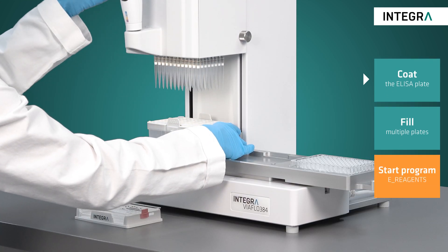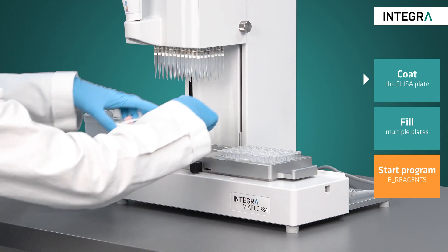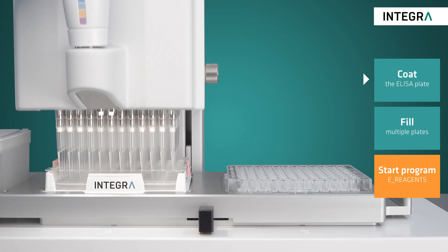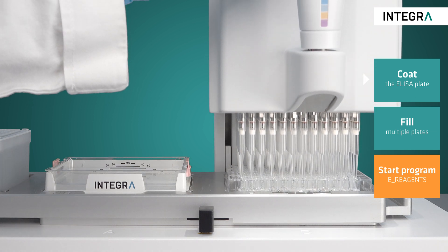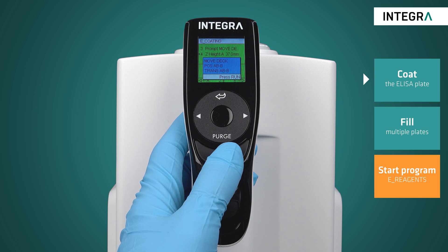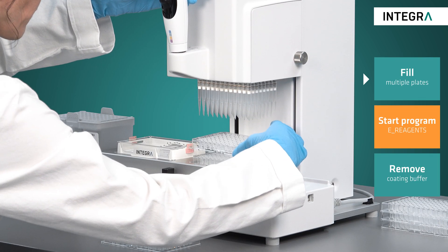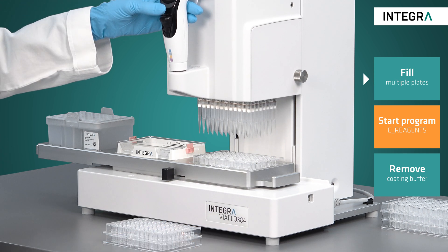After electronically loading grip tips, the coating buffer with pre-diluted capture antibody is dispensed into the ELISA plate — all 96 wells simultaneously. The custom program guides the user with easy to follow prompts, and the heights of dispensing and aspiration are automatically set to avoid any crashes. For higher throughput assays, the ViaFlow 96 quickly fills multiple plates using the repeat dispense mode.